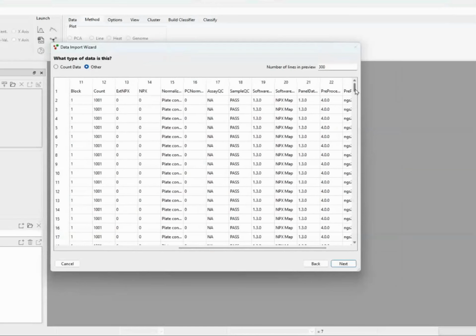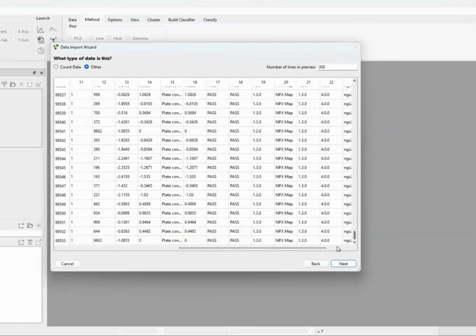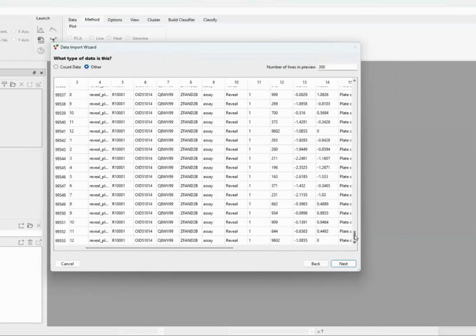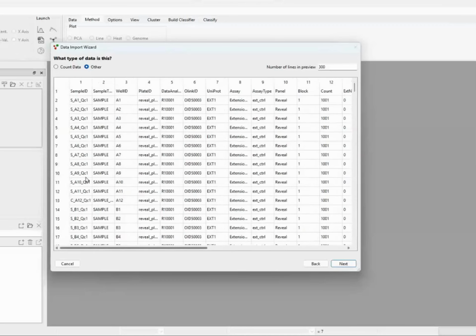Now everything is organized then in a column-based fashion. So we got all our variables stacked on top of each other, and you can see the different Olink identifiers here. So they are the same here, but of course then for different samples, as you can see here. So everything is stacked as vectors. Now, first the separator in this case here, and then how is data organized as a vector or column. That's important. Could be matrix data also from Olink panels.